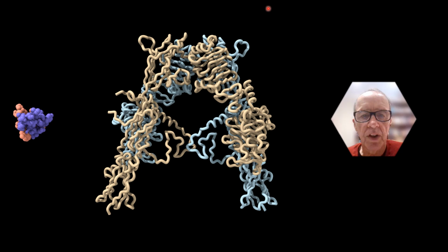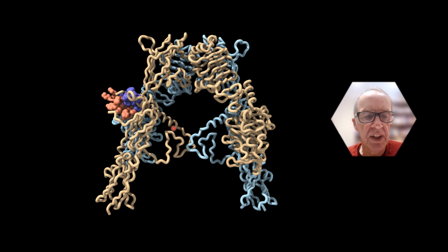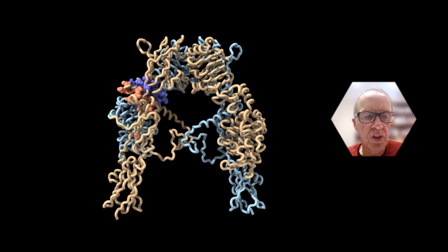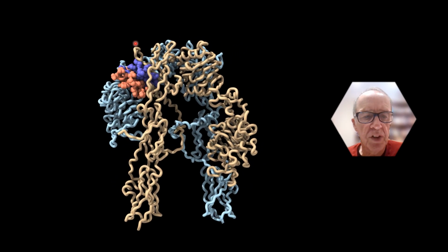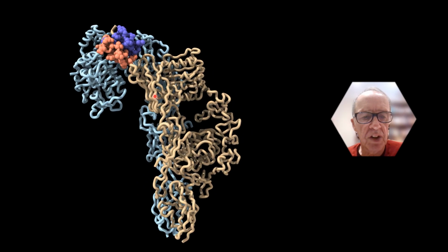So I'm now going to show you a little video that summarizes what we've learned thus far. In the center here is the APO insulin receptor structure. On the left is insulin in its closed form. And if I start the video, you'll see what happens when they dock together. Here's insulin coming in. It engages L1 and alpha-CT. Those elements are then transported up to the head of the receptor. There's the additional winding of the alpha-CT element that occurs.